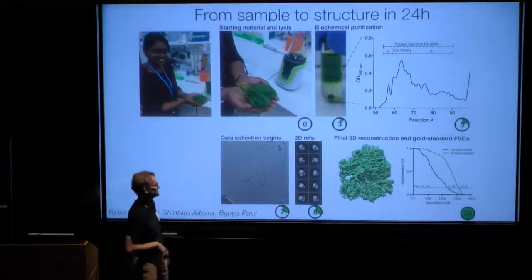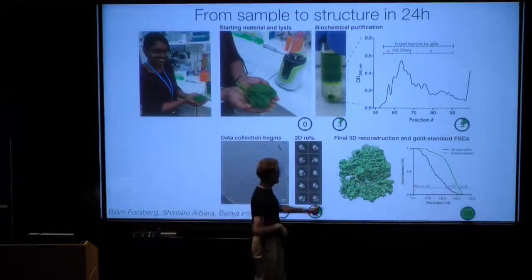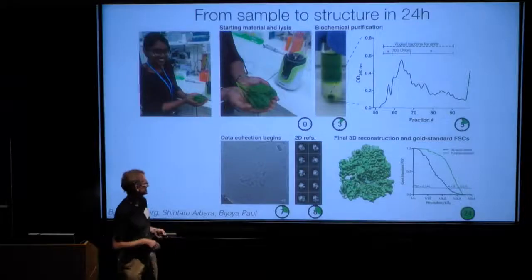But of course, it's amazing, right? You can get this structure, but well, this is not really a structure. This is a density, that's not the structure. And that's kind of the problem. We're getting really good at determining these densities.